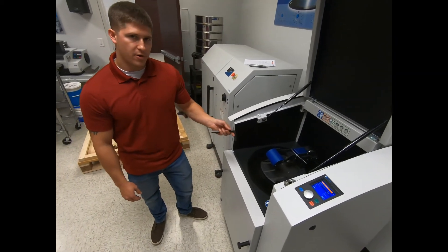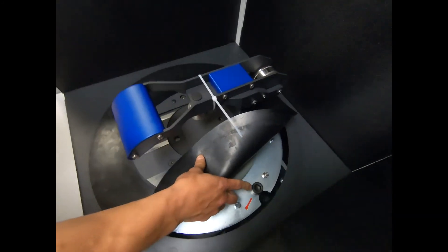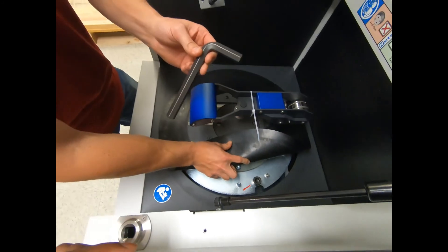The last step to installing your RS200 is to cut the zip tie and remove the two shipping bolts on each side with the allen key that comes with the unit.